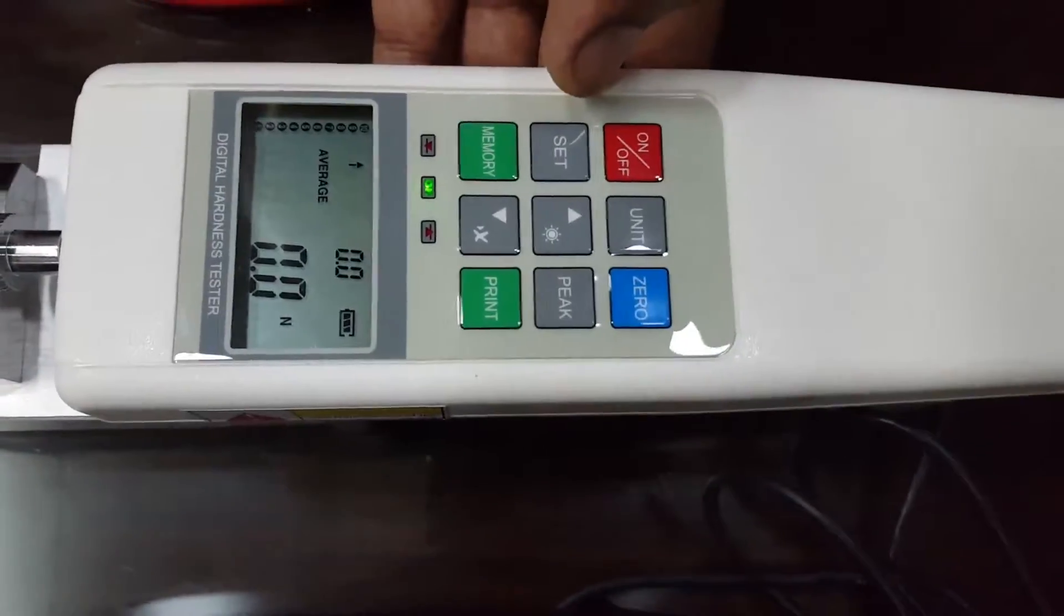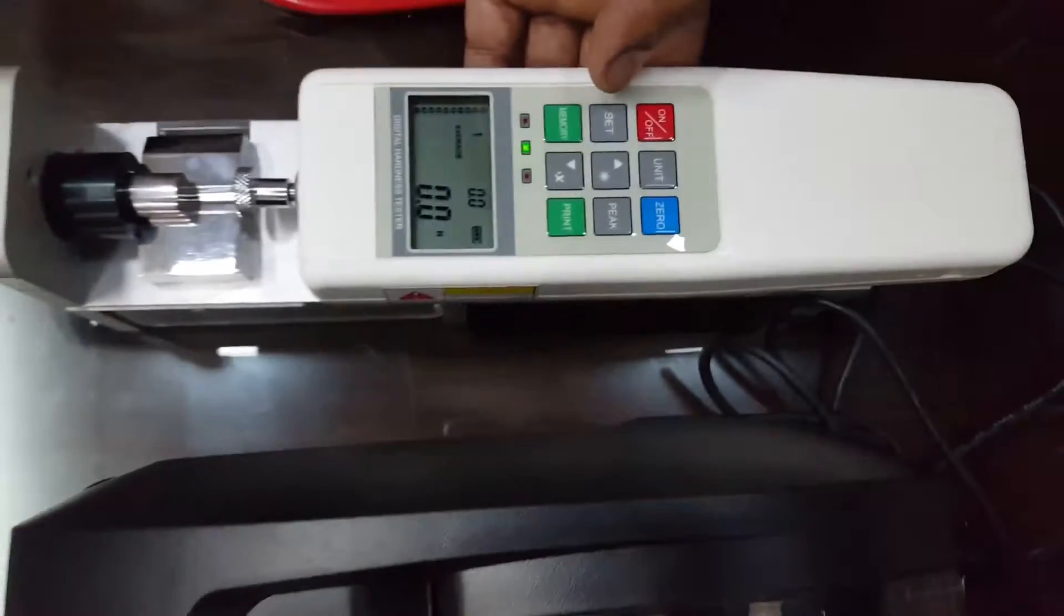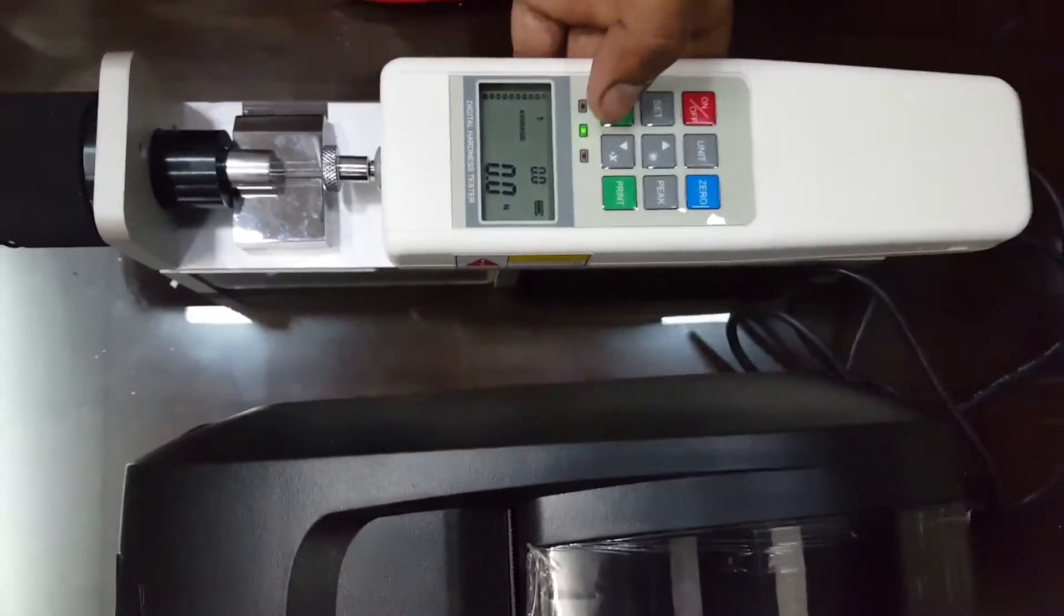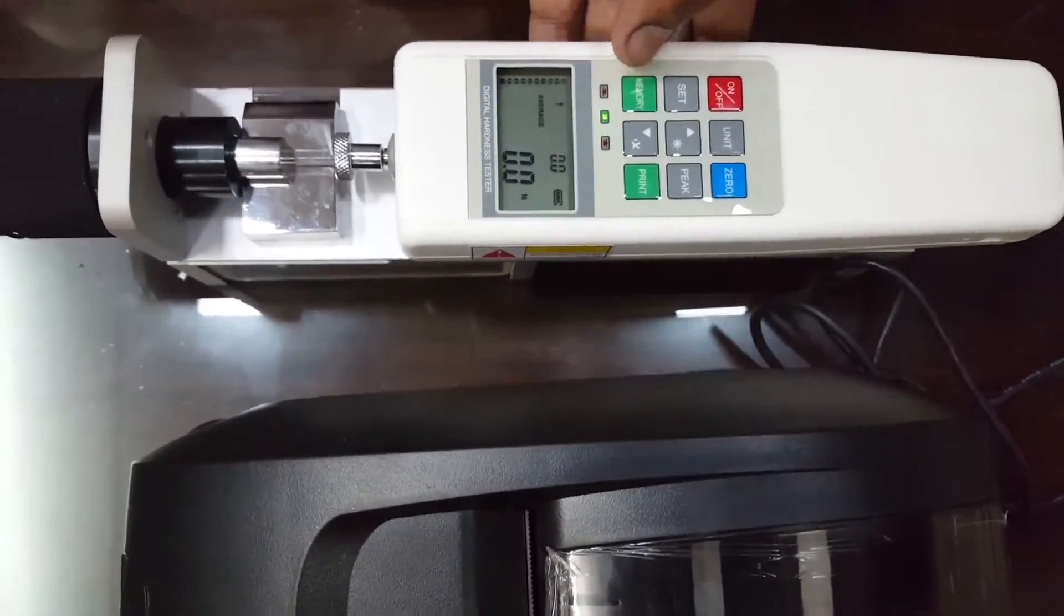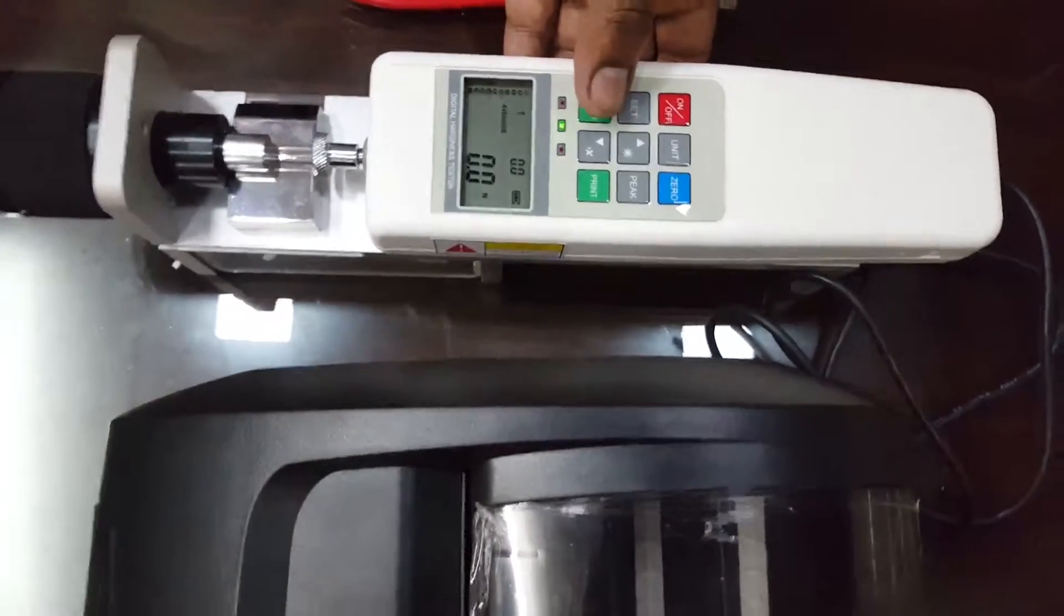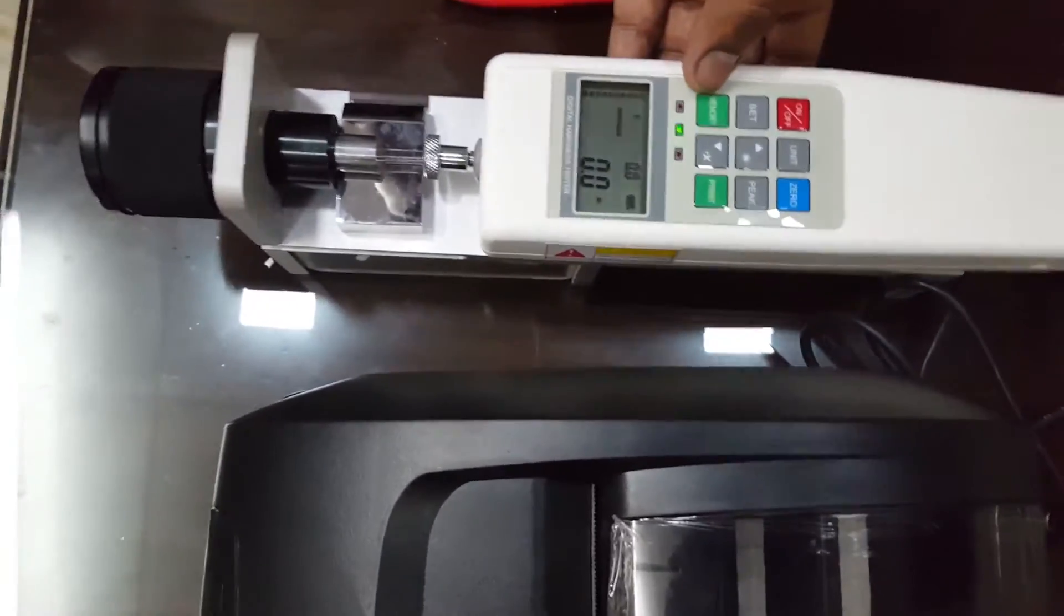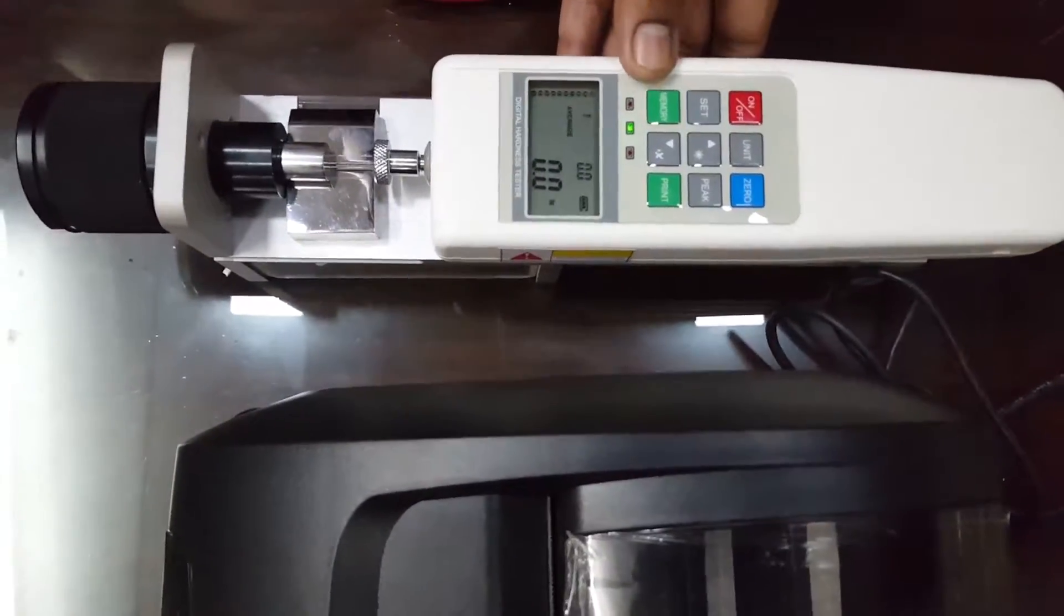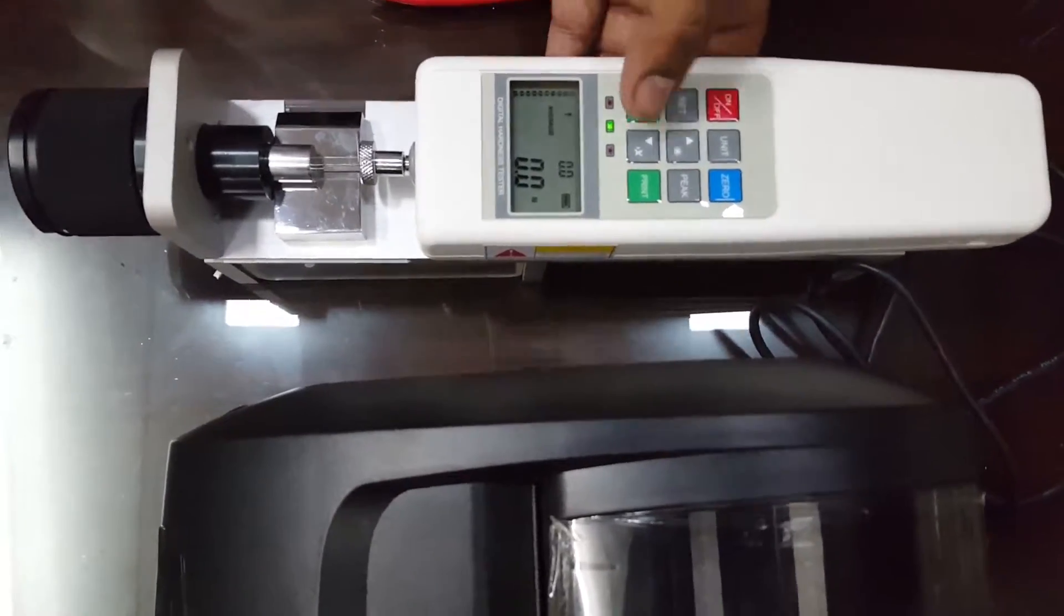With the print feature we can take out the print of all 10 tablets with minimum, maximum, average, and GLP printout with date and time.